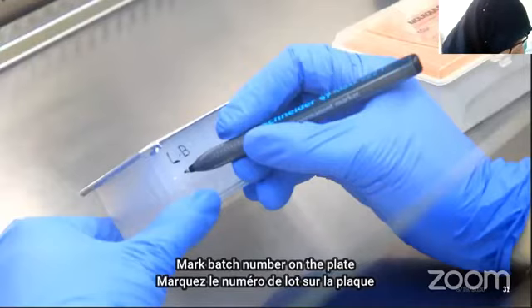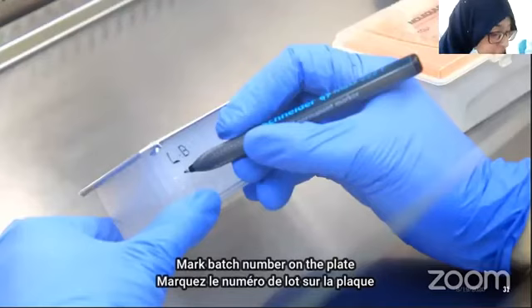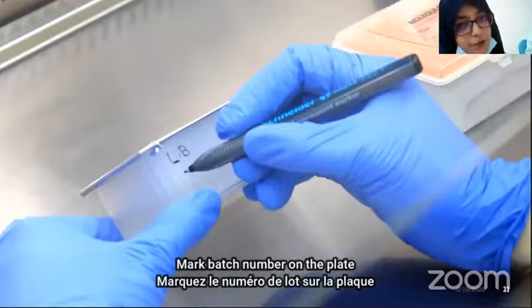Next is, negative and positive control wells are always separate. They are treated as we treat individual samples. Yes, negative and positive control wells are separate, but if we have the negative control well and the very next well is the positive control well, there is no possibility of cross-contamination if your handling is good.